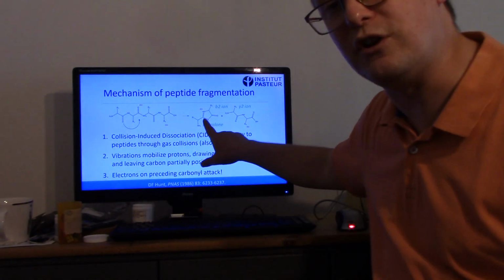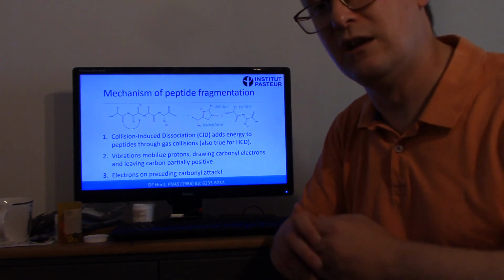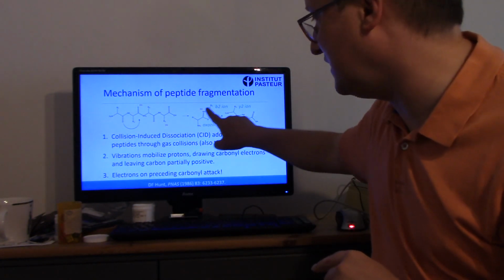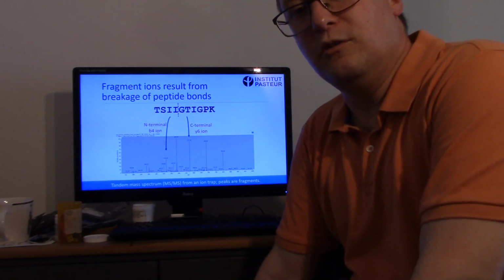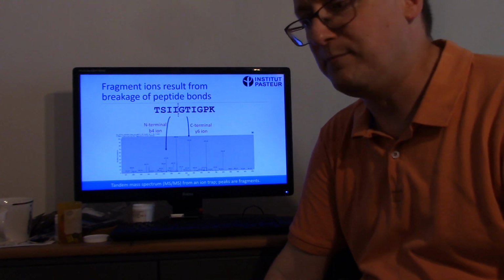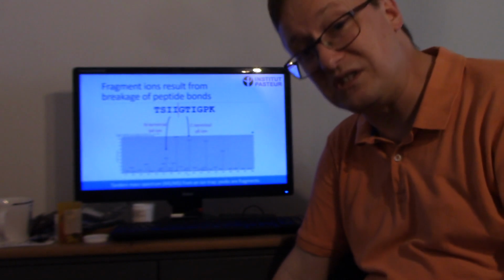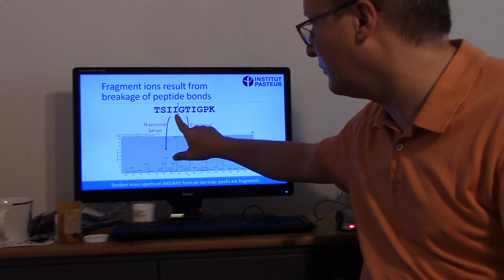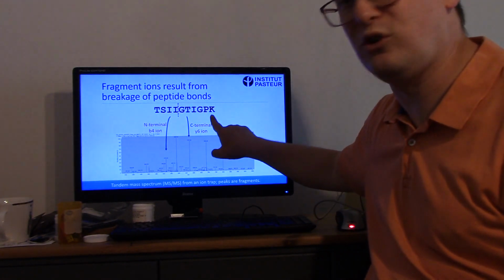It's useful for you to know that B ions do not have the same structure as Y ions, because Y ions are essentially small peptides. B2 ions have this weird circularized piece at the C-terminal end. Many fragment ions may result from the breakage of a peptide bond. In collision-induced dissociation, we most typically think about breakage at the peptide bond forming an N-terminal B ion, as I mentioned in the last slide, and a C-terminal Y ion.